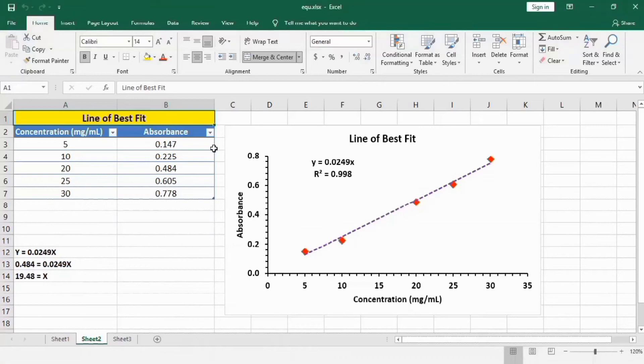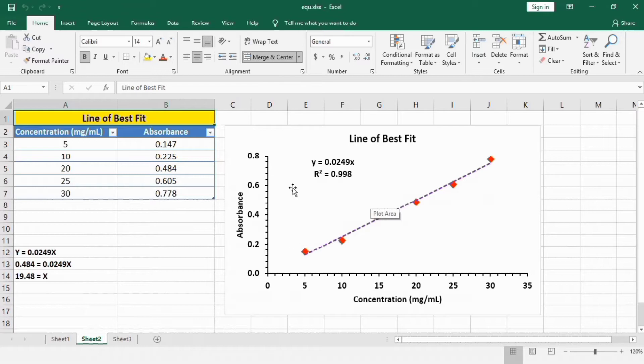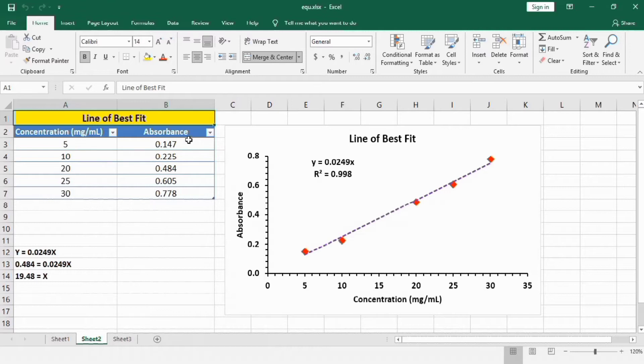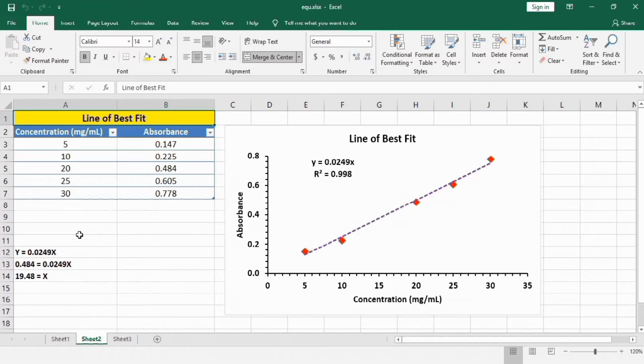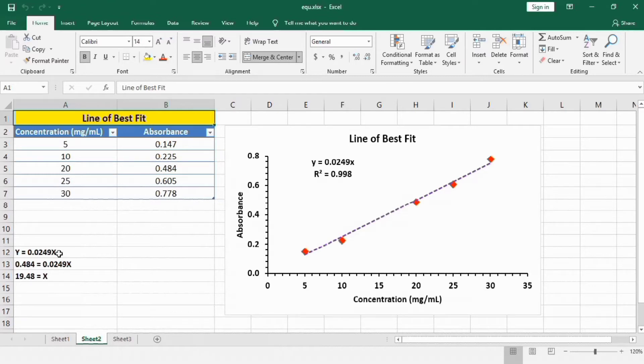In this video you will learn how to insert line of best fit in Microsoft Excel chart. You can see here I have data of concentration of a compound which is given in this column and the absorbance of that compound at that particular concentration. You will also learn how to use this regression equation to find the concentration of a compound if you know the absorbance of that particular compound.